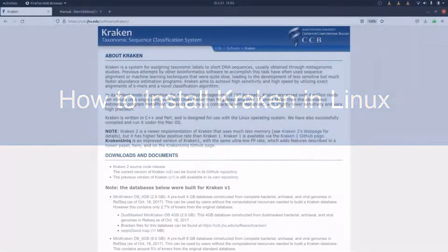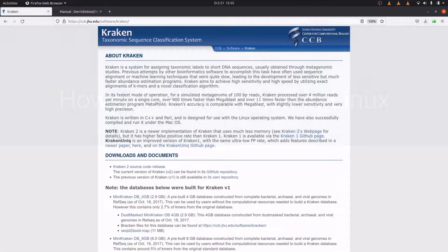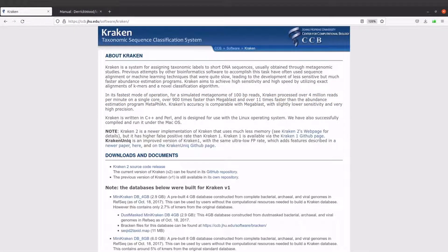Hi everyone, welcome back to the Bioinformatics Coach channel. In today's video, I am going to show you how you can install and set up Kraken on your Linux system. Kraken is a system that is used for assigning taxonomic labels to short DNA sequences.